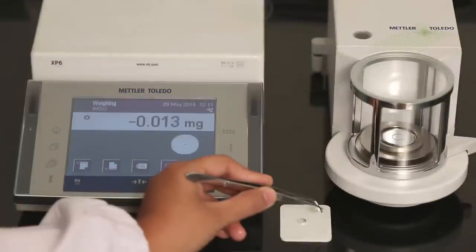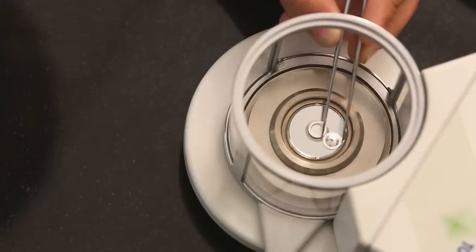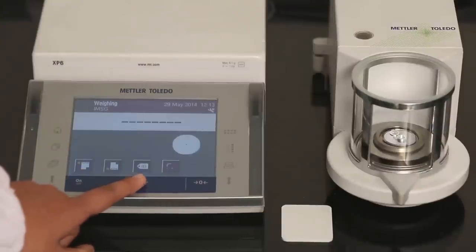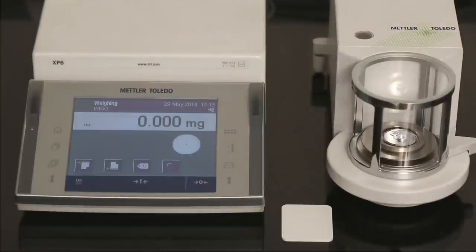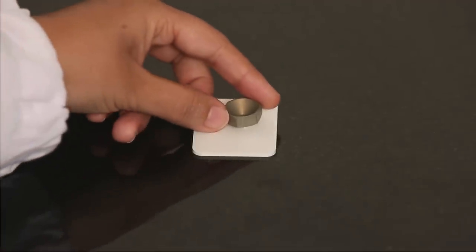Place the crucible and lid on the balance and tare. Place the funnel contained in the crucible box on the crucible and fill in about 10 milligrams of powder with a spatula.